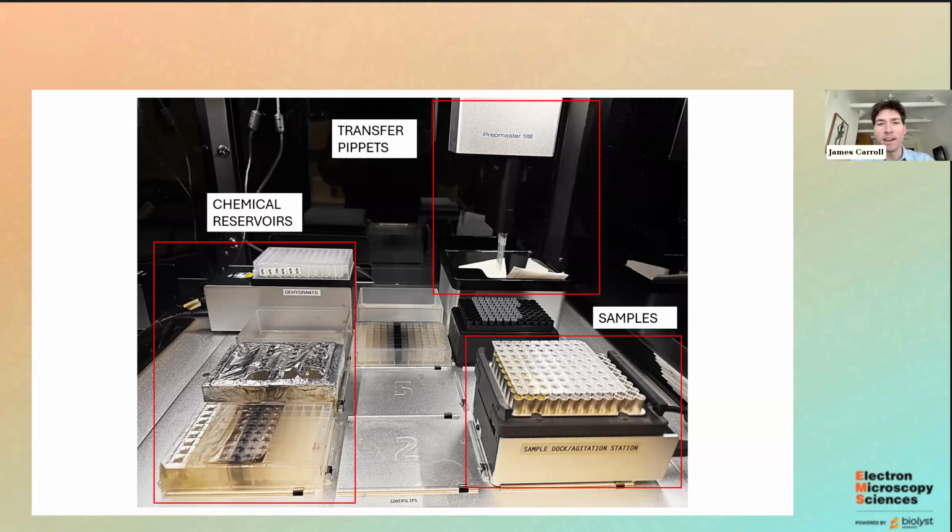The next question is, if you need to prepare a sample with a certain direction or orientation in the resin, do you do the orientation once you pull it out of the machine? These are just little conical tubes. Before I start the process, I make sure that everything's sitting down in the bottom of the reservoir.